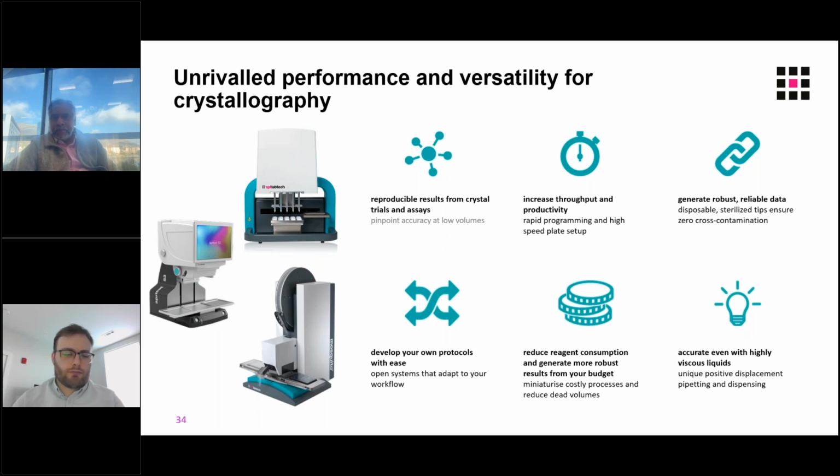Firstly, how much do these instruments assist with miniaturizing crystallography? So these instruments primarily help with miniaturizing crystallography at the Mosquito step. Mosquito is able to set up drops, as Susmith has mentioned, down to 100 very reliably. It can also go even lower, but even at 100 or even 200 nanoliters, it's still using either 10 or 5 times less than you would be doing by hand with a 1 microliter instrument. So generally, that's the range we recommend going down to with the Mosquito.